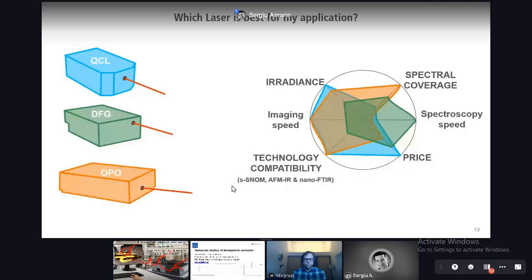Otherwise, you can start a new live question. Another question from Varun: can we use the IR nanoscopy in grazing mode for mapping regions in polymer thin films? Well, that's actually a very good question, and here I refer to one of our past webinars, I think the polymer science one, where we had the introductory slide on nano-FTIR.